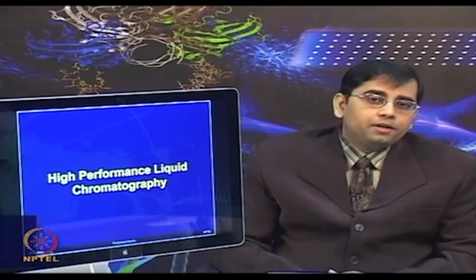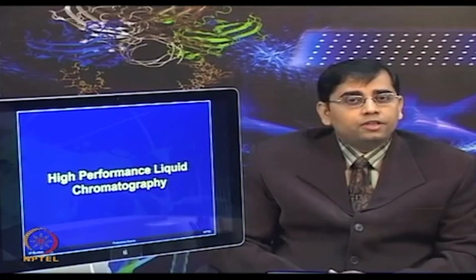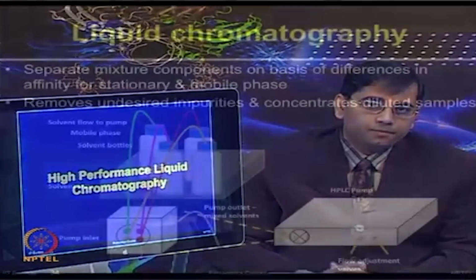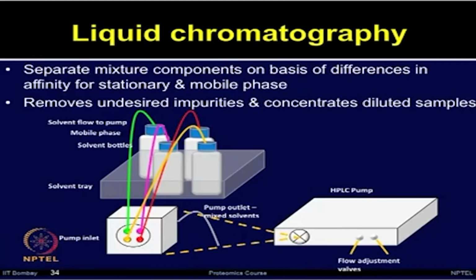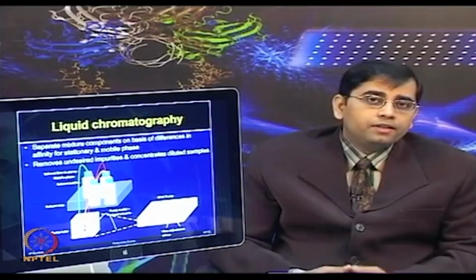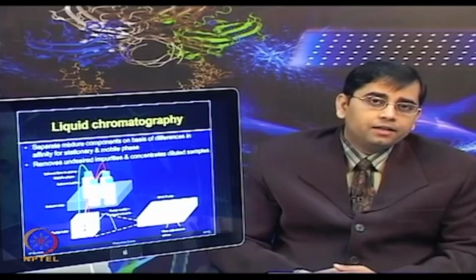Better separation and resolution of the components can be achieved by HPLC. So, what is liquid chromatography? Liquid chromatography separates mixture components on the basis of differences in the affinity of the stationary and mobile phase. It can remove the undesired impurities.